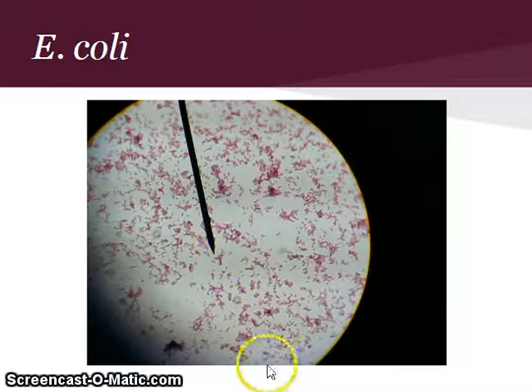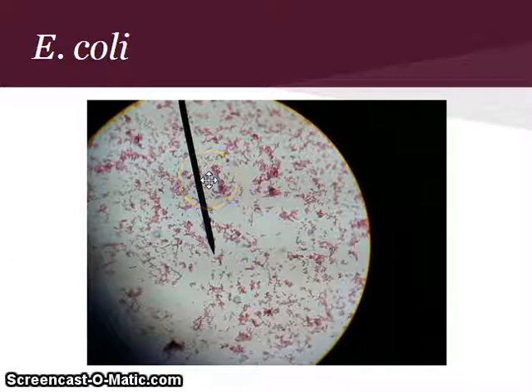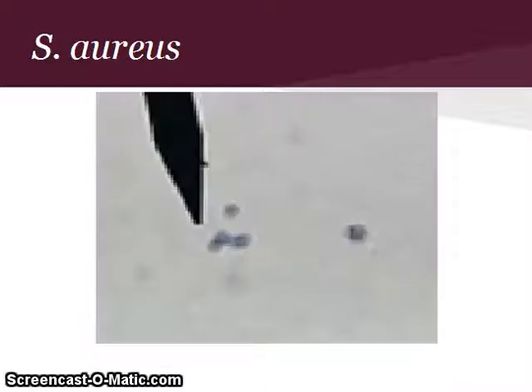So here's E. coli. You can see that it's a pink bacteria. It's rod-shaped, if you look closely. And this was a control, really. We knew this. This was something that has been proven by other scientists, and we could look it up and figure it out, and we could compare our patient sample. So now, moving on to Staphylococcus aureus here. You can see the purple spherical shape, the coccus representing the spherical shape, and you can see the purple bacteria, therefore gram-positive.